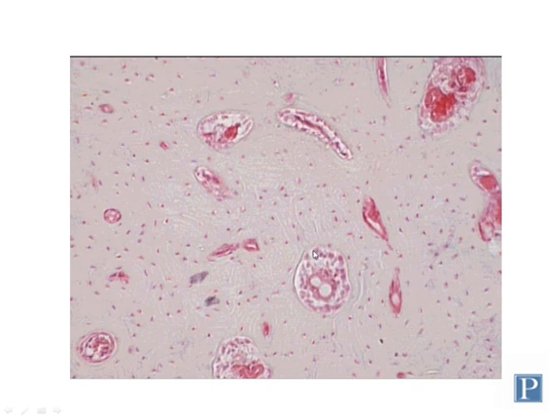So in addition to these round-shaped haversian or central canals, you have these other canals which are roughly perpendicular or oblique to those. These are called perforating canals or Volkmann's canals, and these carry blood vessels in from outside of the bone to supply the bone with blood. So these blood vessels will travel through these perforating canals from the outside, and then will join with these central canals or haversian canals, at which point these blood vessels branch off and travel along the longitudinal axis of the bone.